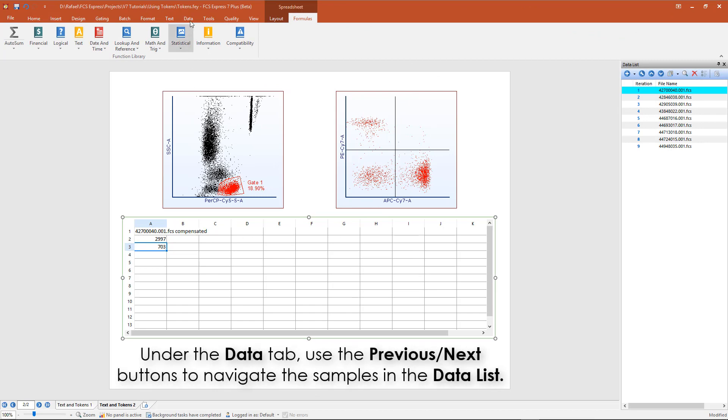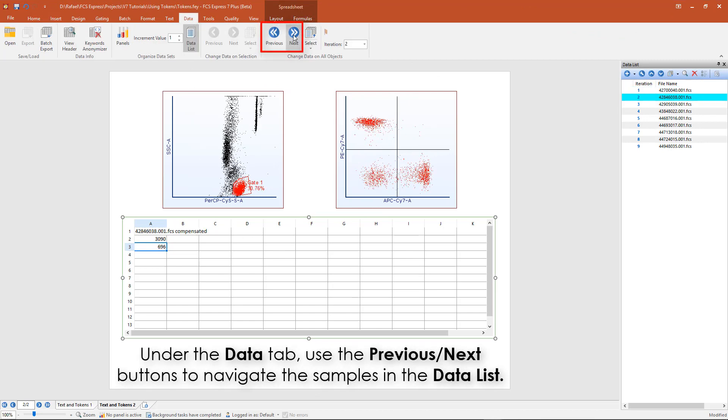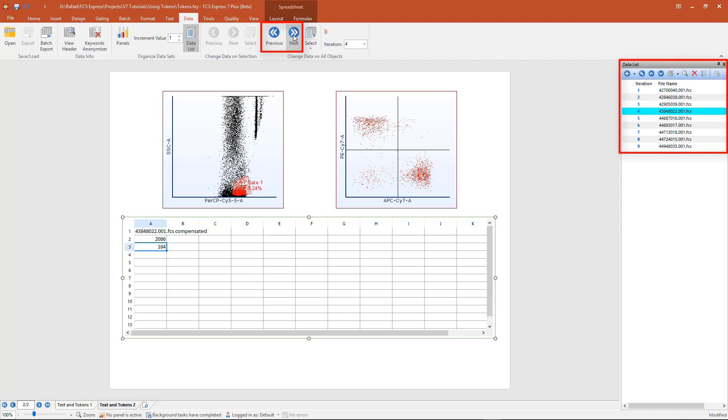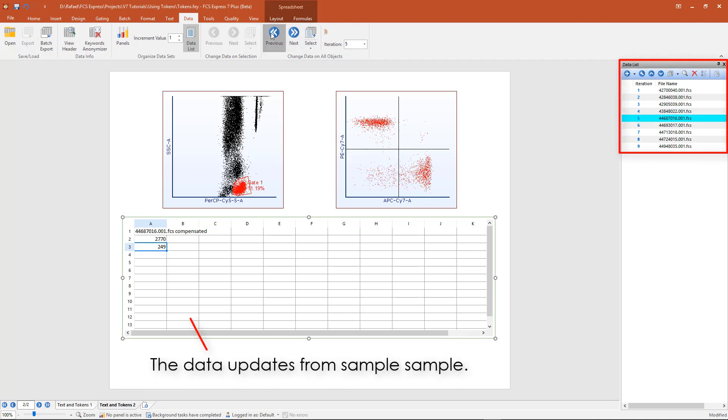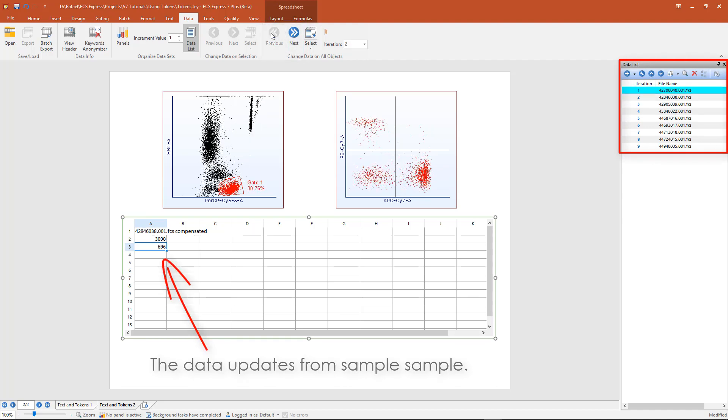From the Data tab, use the Previous or Next buttons to navigate through the samples in the data list. As you navigate between your samples, the data automatically updates.